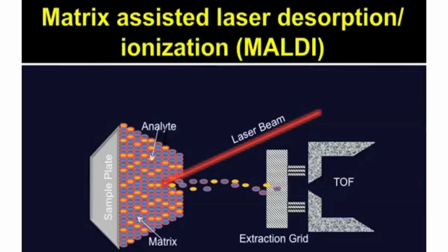Now those specific proteins can be taken, and before that, as we are using MALDI-TOF as a technique for analysis, what exactly is MALDI-TOF? MALDI is an ionization source, a matrix assisted laser desorption ionization technique. There is a sample plate. We'll discuss in depth in the further slides how exactly that plate looks and how you add the samples. So this is just an overview.